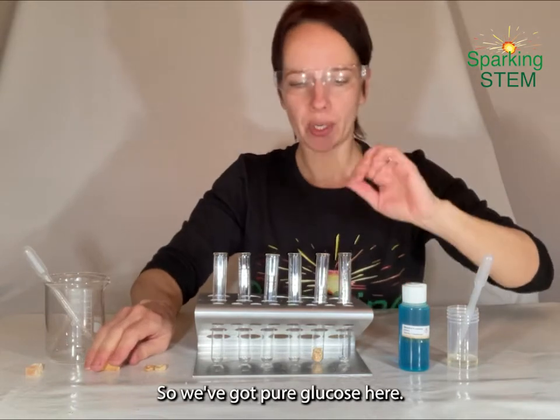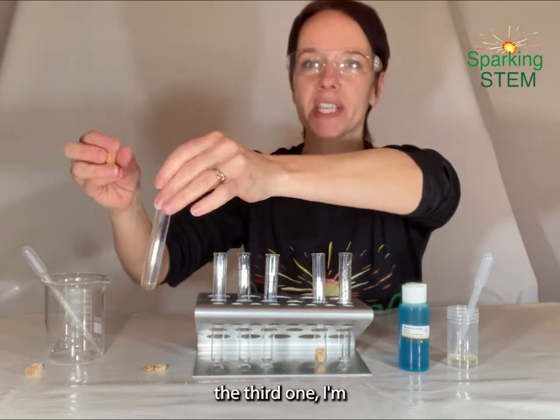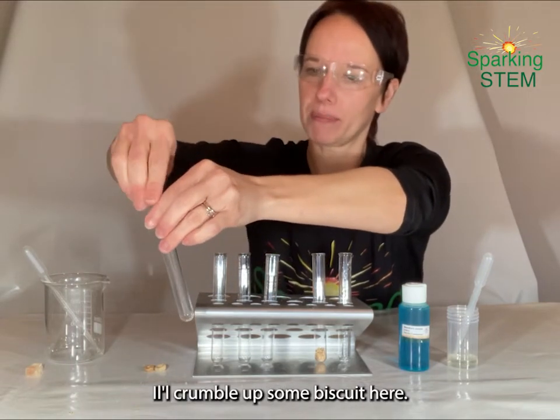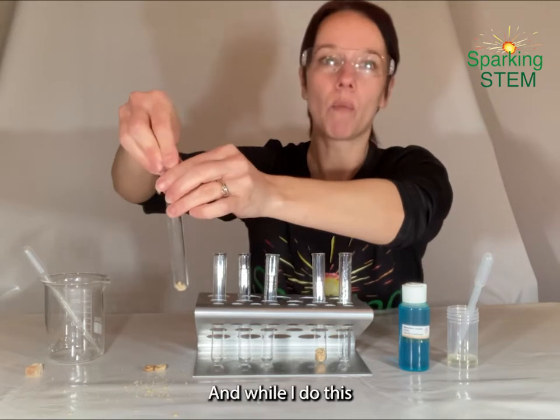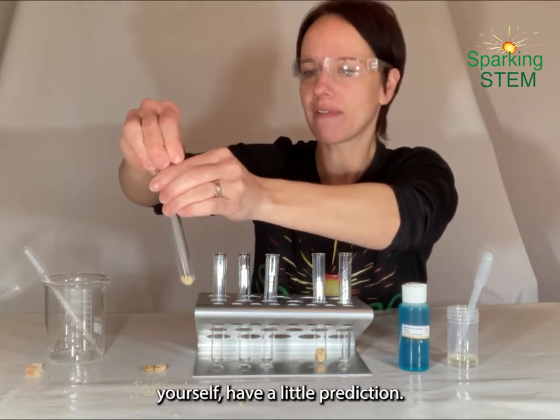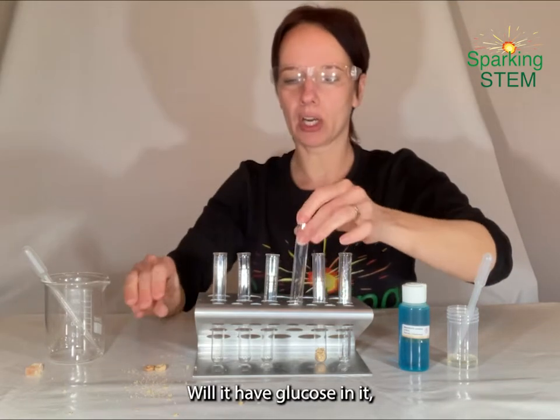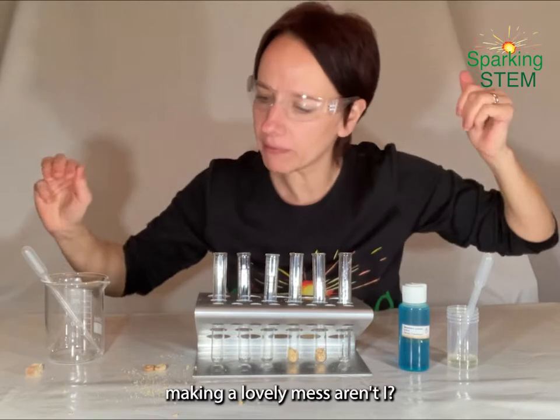So we've got pure glucose here, we've got some breakfast cereal here. This third one, I'm going to add some biscuit — I'm going to crumble up some biscuit here. And while I do this, you might want to be thinking to yourself, having a little prediction: will it have sugar in it? Will it have glucose in it? Making a lovely mess, aren't I?